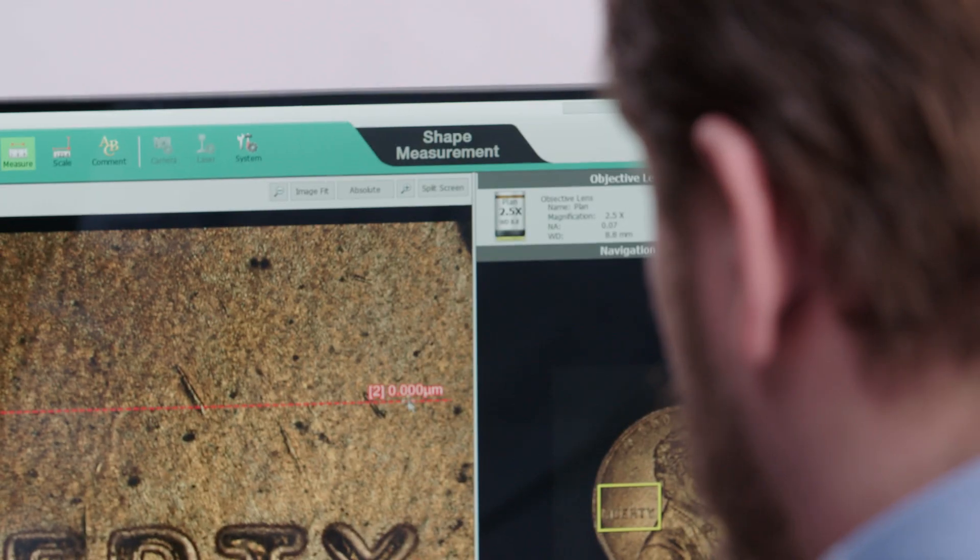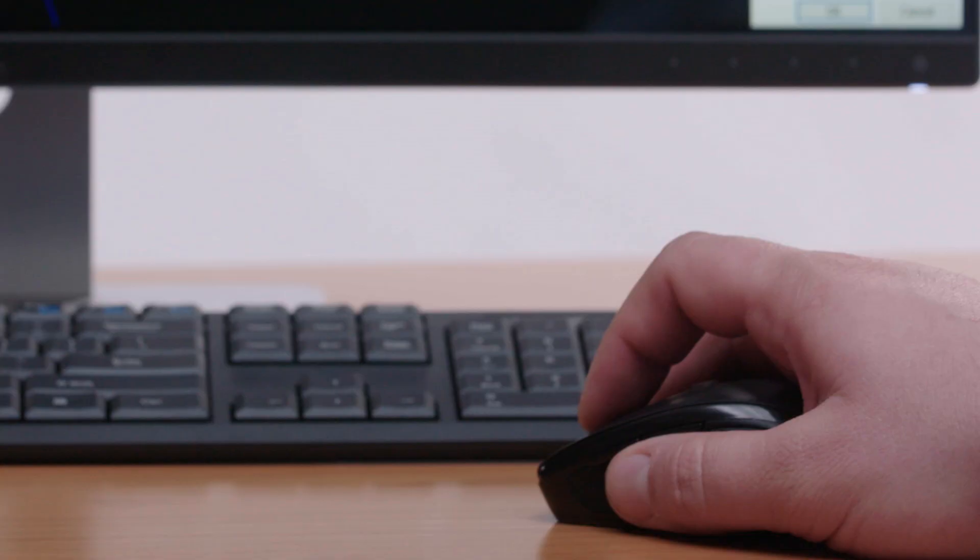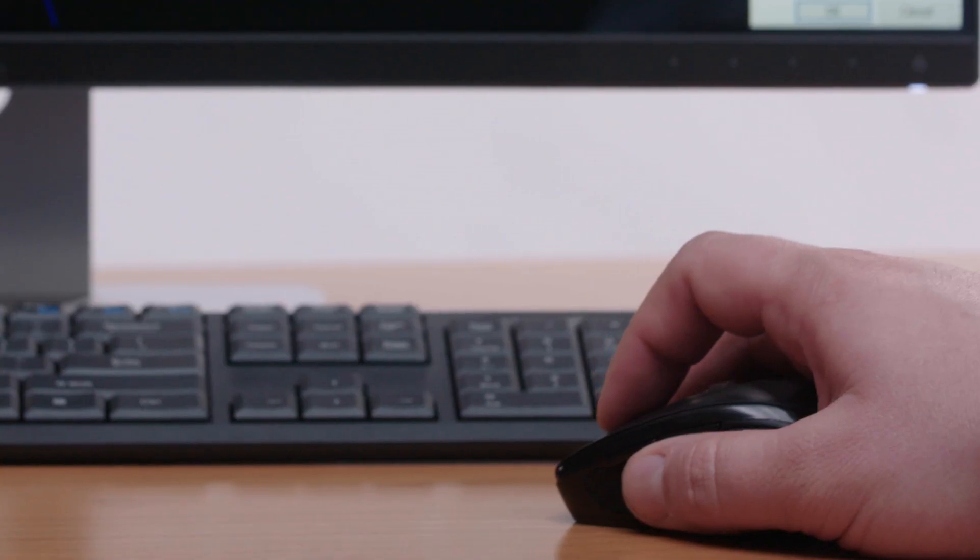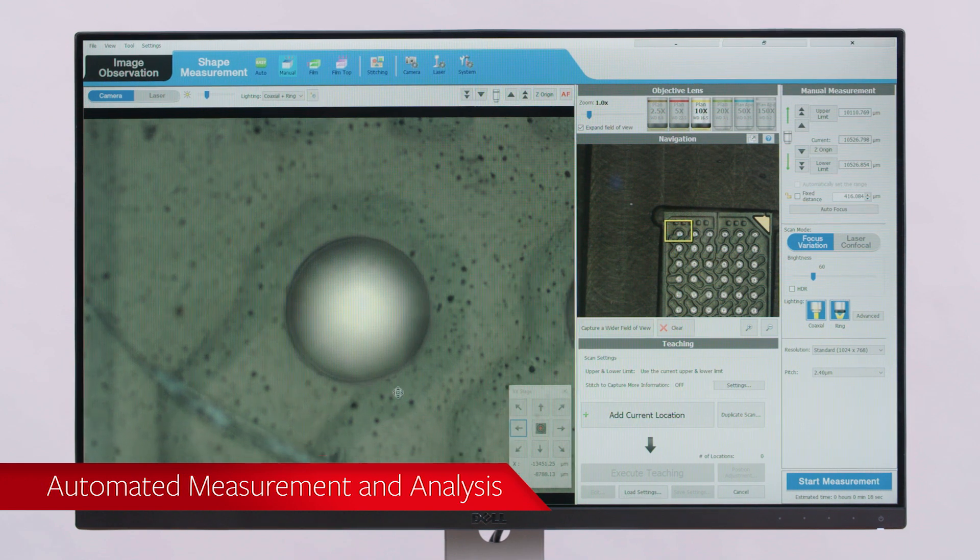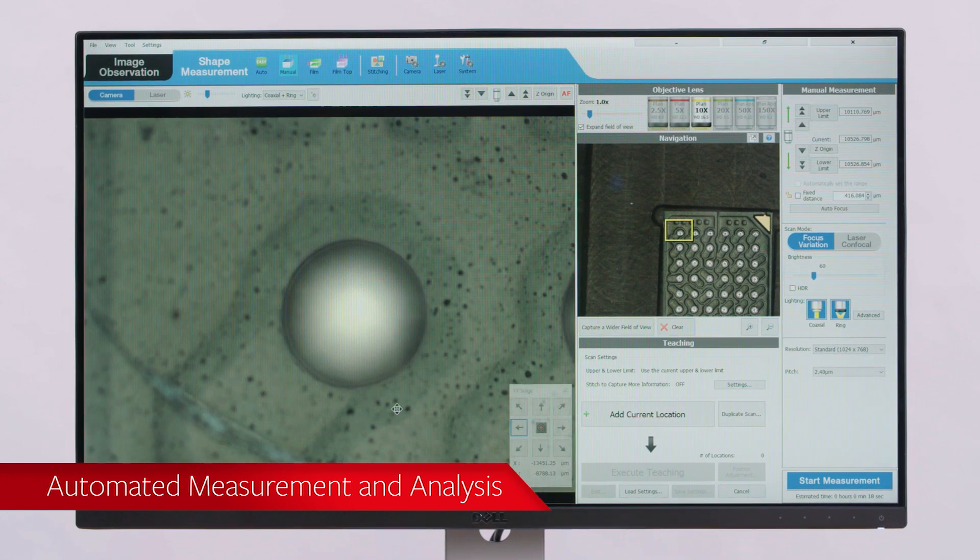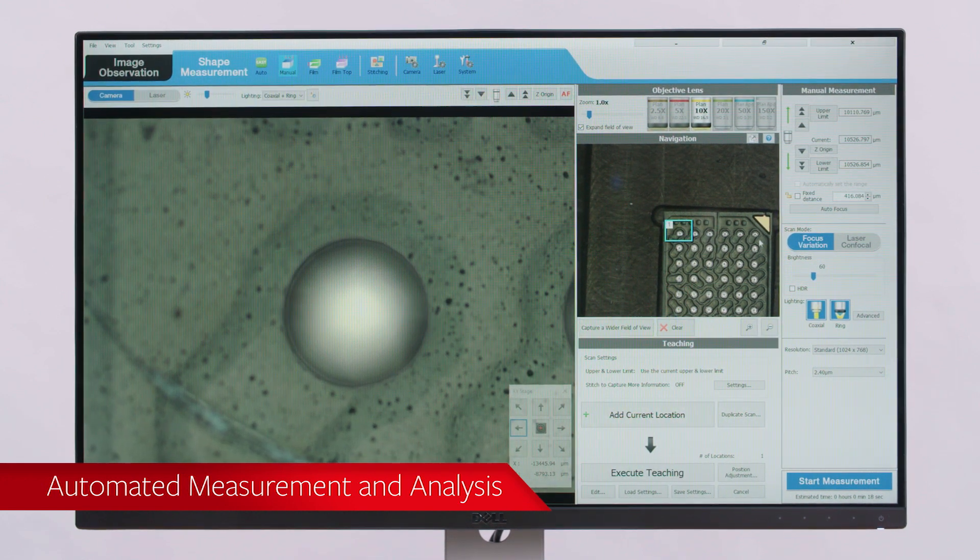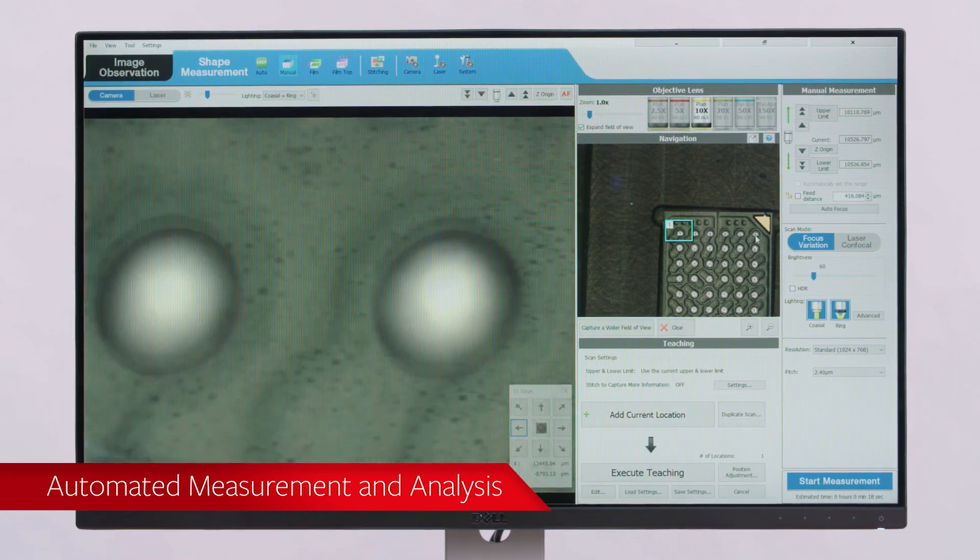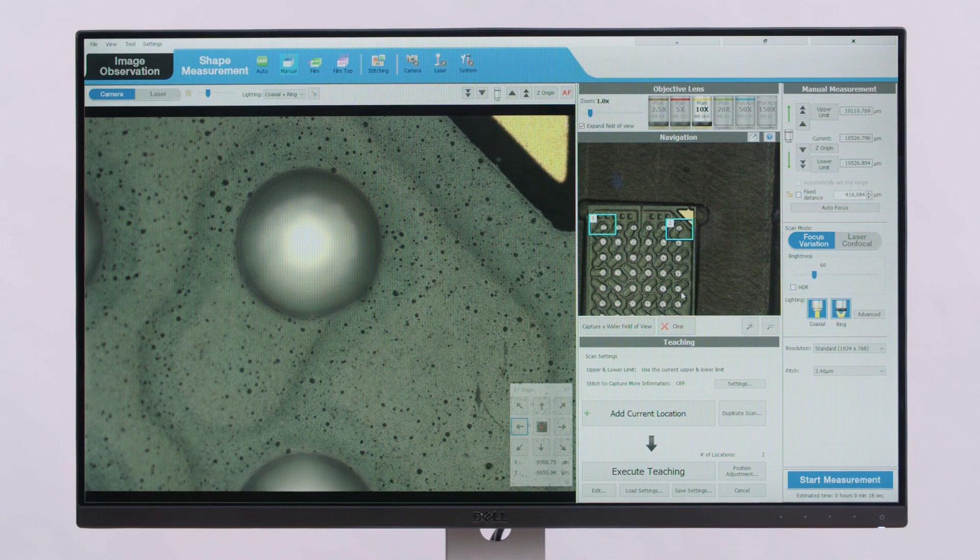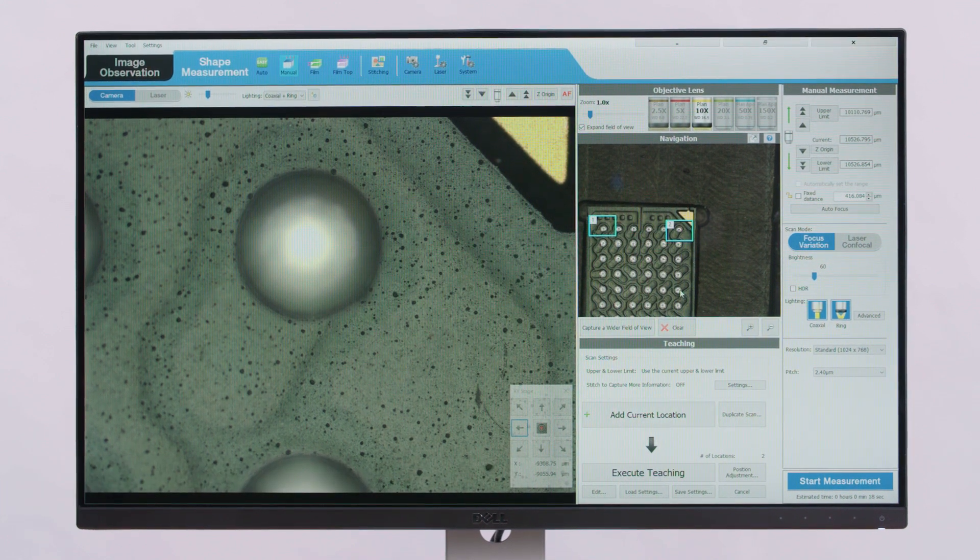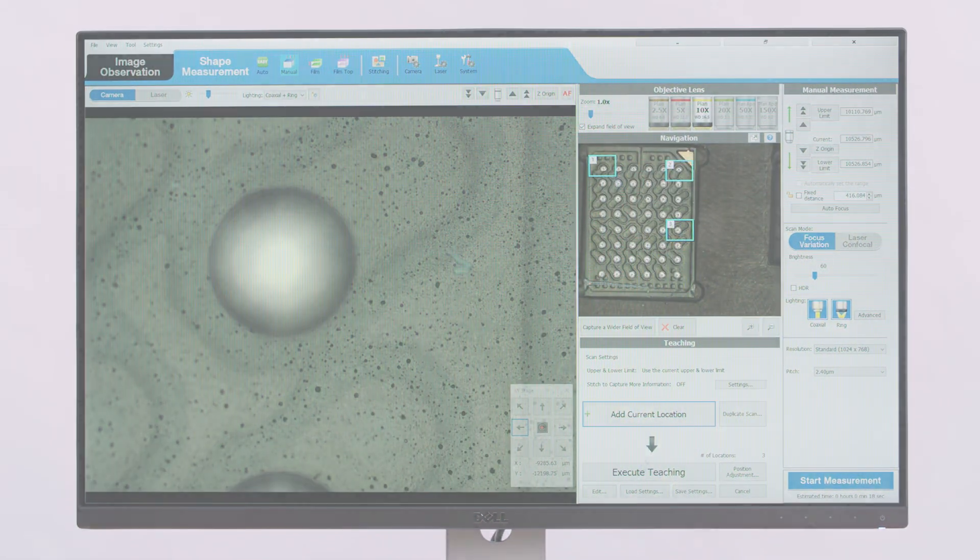Several features have been added to automate and program the VKX series 3D measurement system. Teaching lets users program the microscope to travel to user-specified locations on the stage to collect data, eliminating the need for operators to manually measure each area separately.